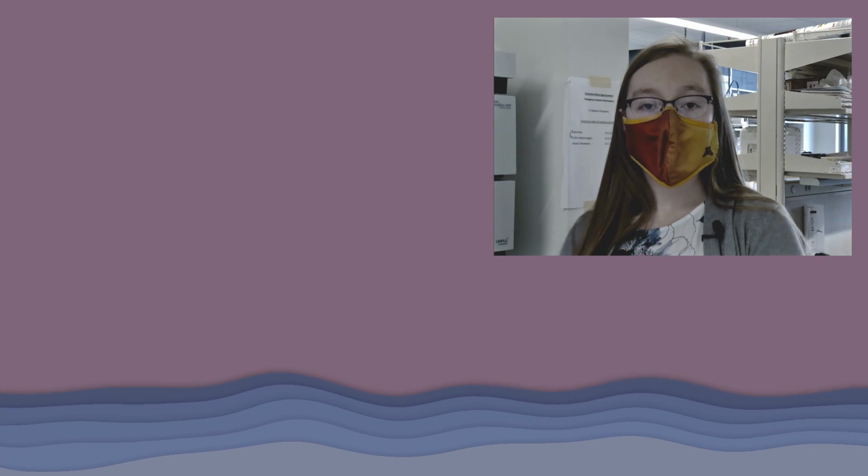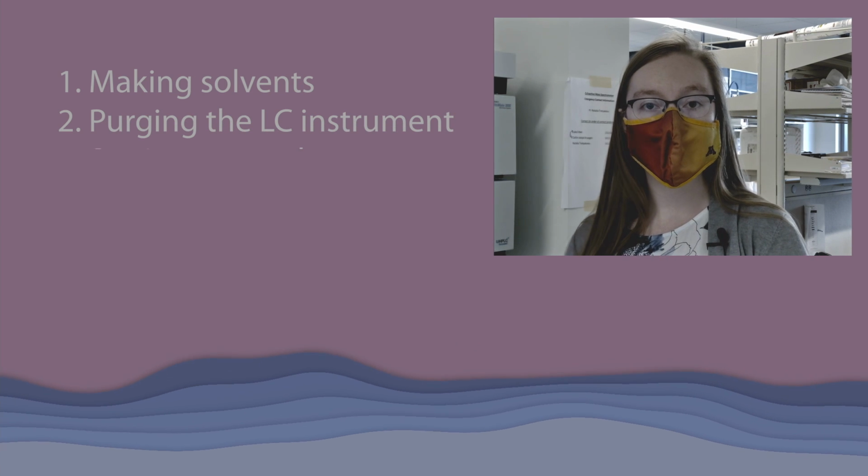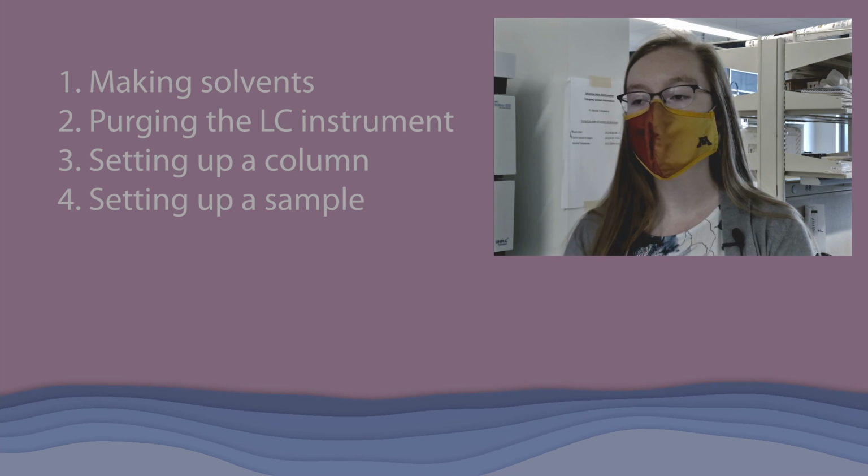Hi, I'm Caitlin, and I am going to teach you how to set up an LCMS instrument in NanoFlow for sample analysis today. This protocol involves 4 steps: making your solvents, purging the LC instrument, setting up your column, and setting up your samples and your sample analysis sequence.